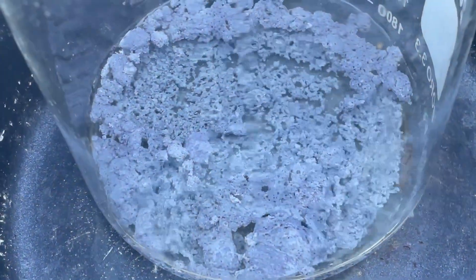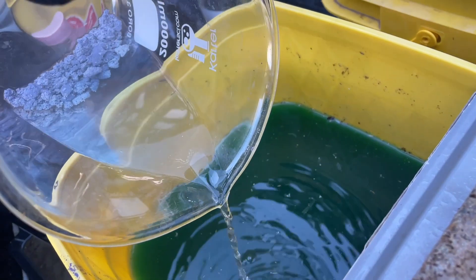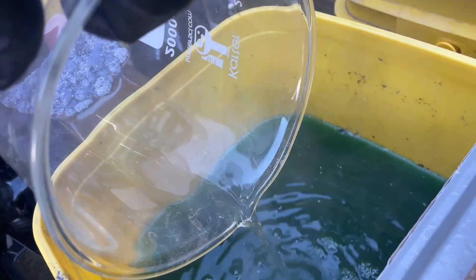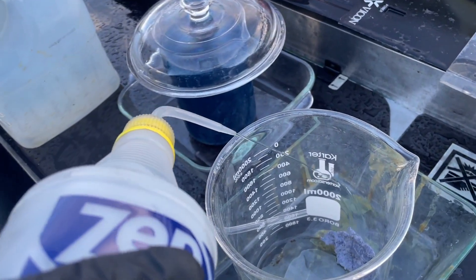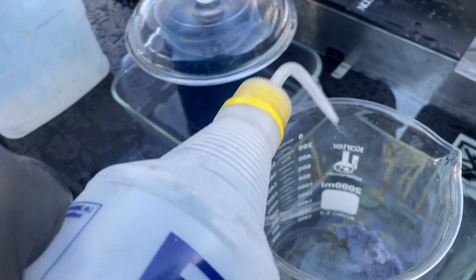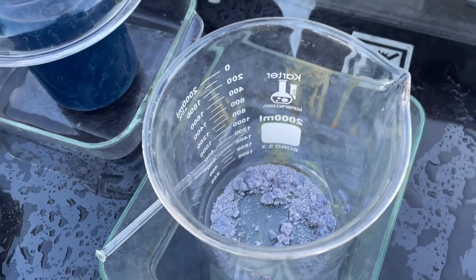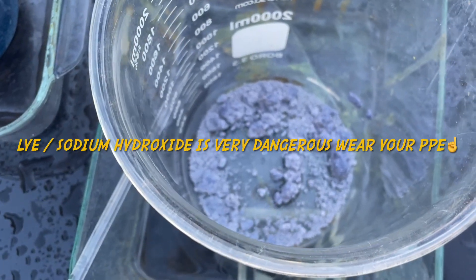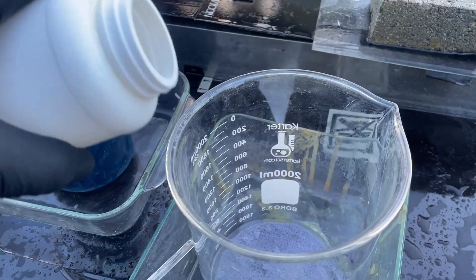Looking cleaner folks — we got a nice boil going, silver chloride chunking up real nice. I like to add a little bit of extra water before I go putting any caustic soda in there.